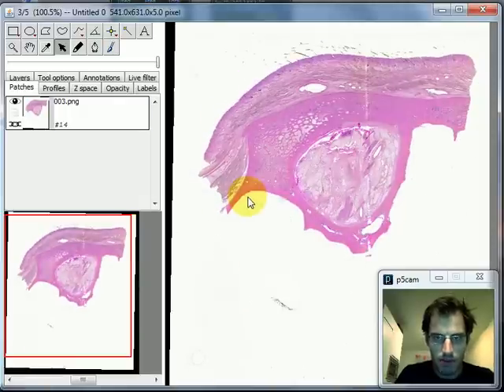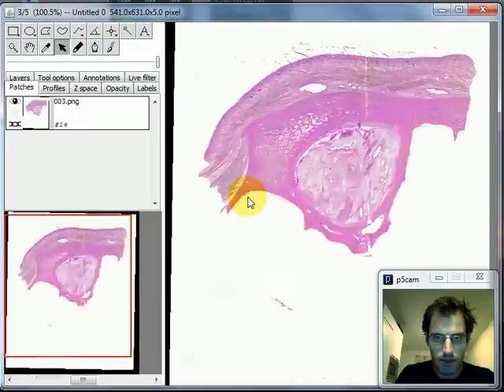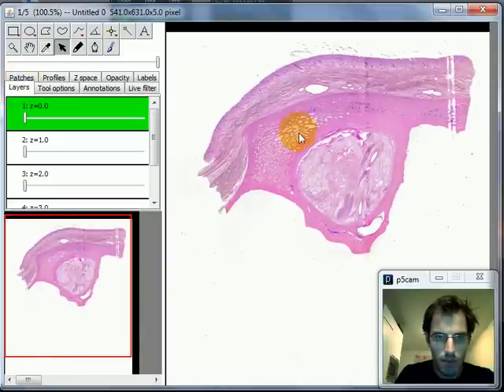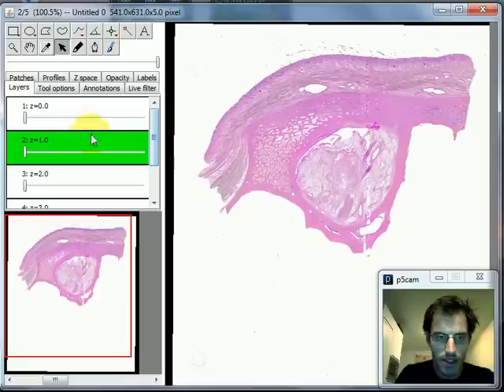Look what it's done. Wow. It's a very nice alignment. Just double check by selecting the second slice.